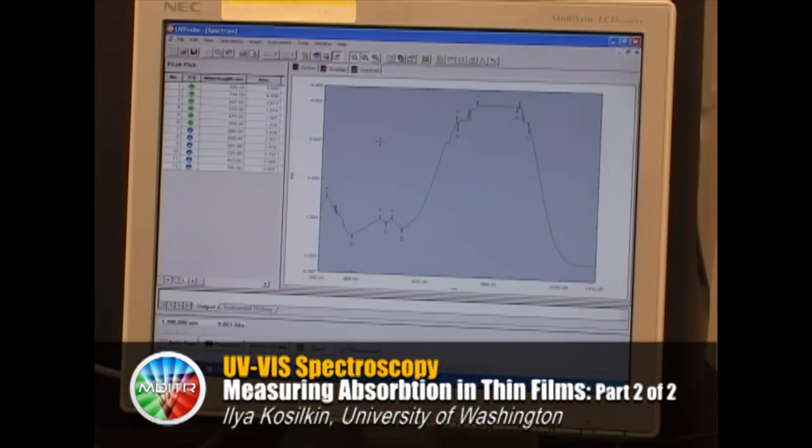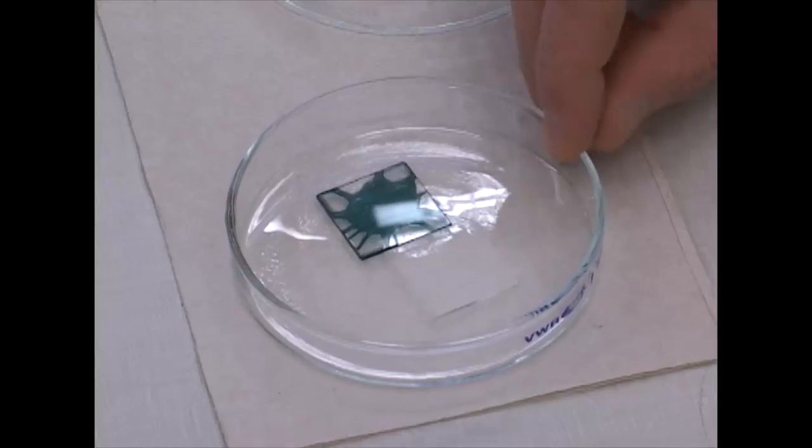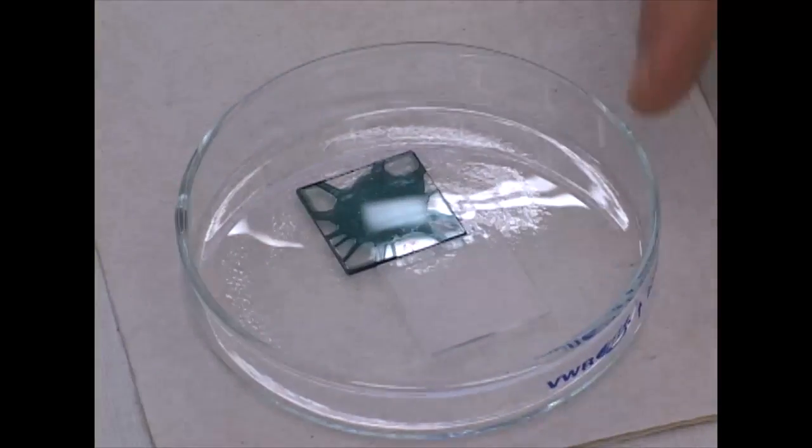And now we will proceed to absorption in thin films. What we have here is two glass slides.